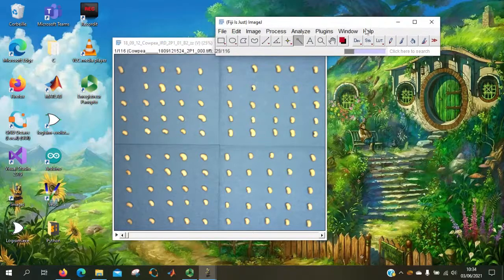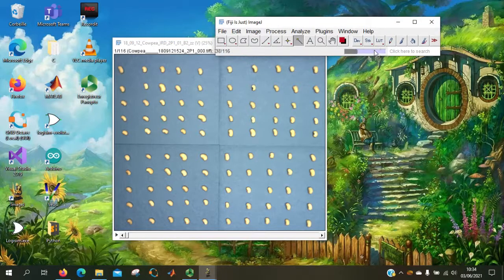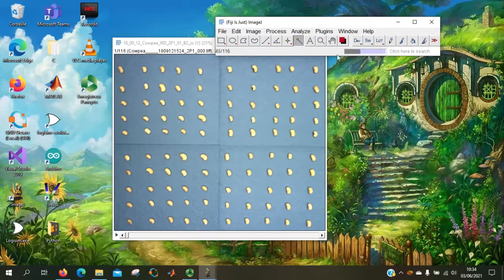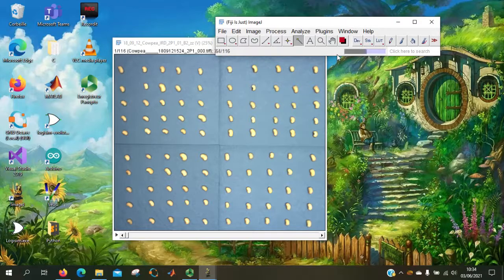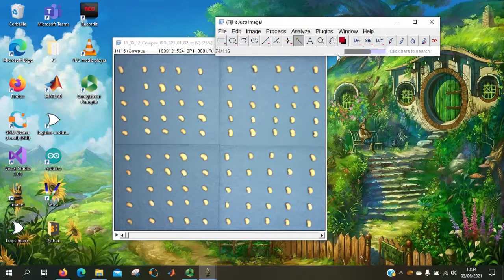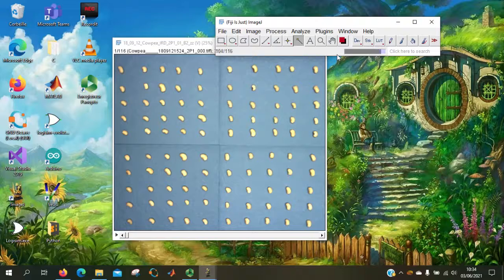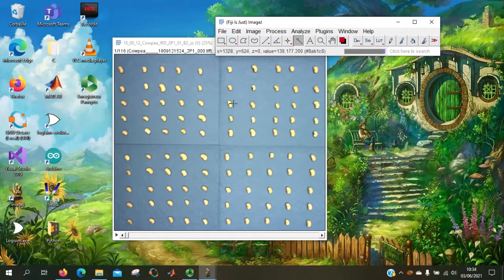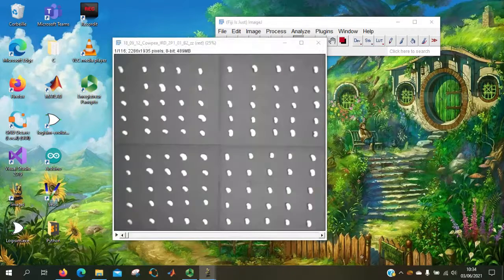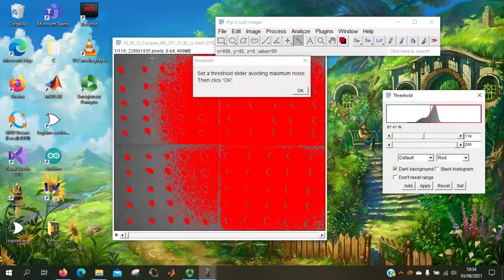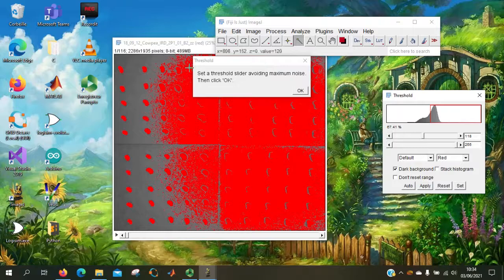So here it's processing. It will split all the channels to get the best contrast. So due to the blue background, it will keep only the red channel.